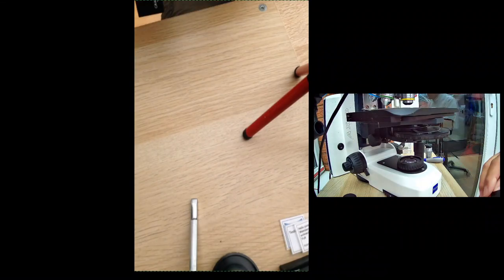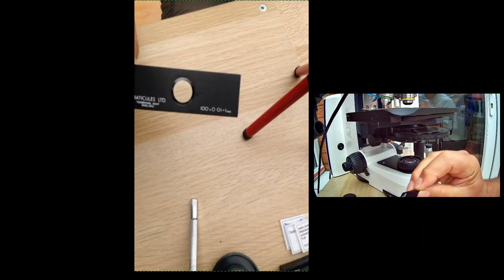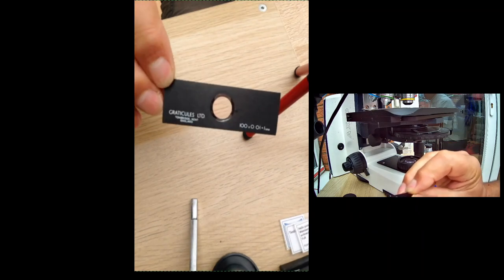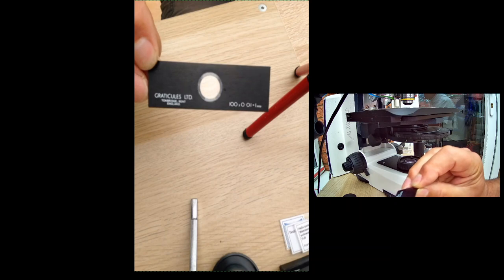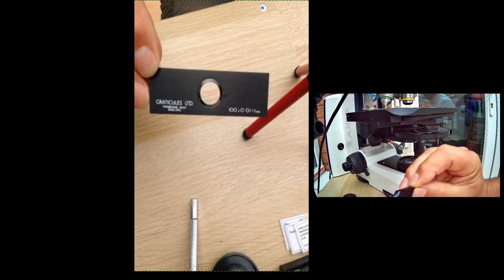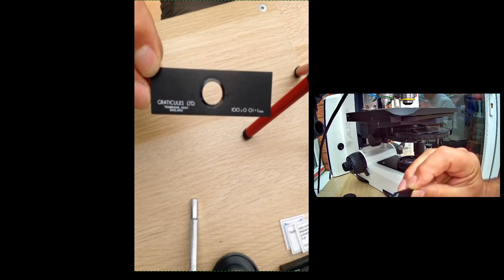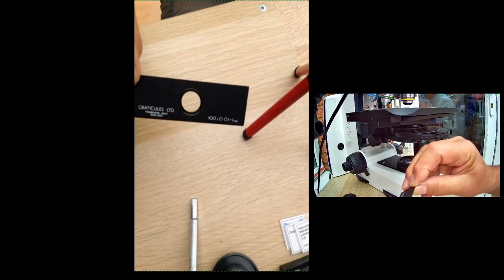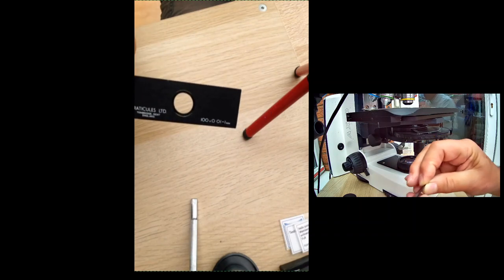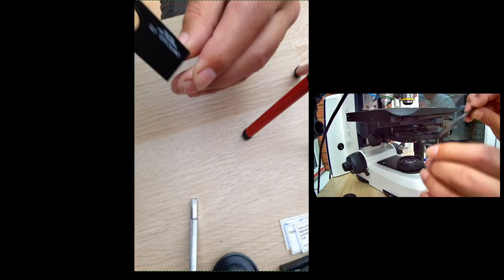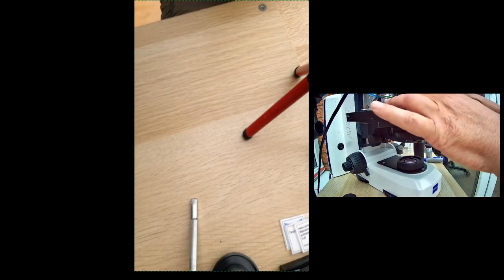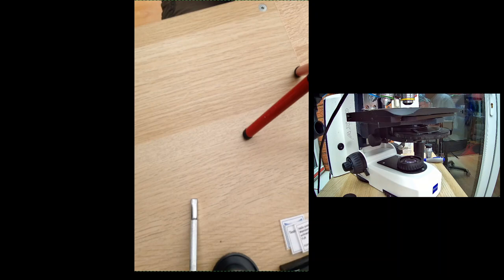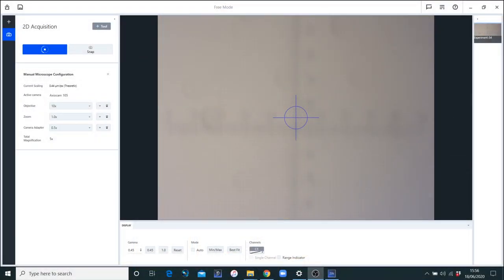This is a device which has a known scale. This one is one millimeter cut up into 10 micron divisions. These are available from Zeiss, from other companies, and they're also available with some sort of traceability, so they might come from NPL or NIST, somebody like that. So let's pop it back on the microscope and have a look at the image.